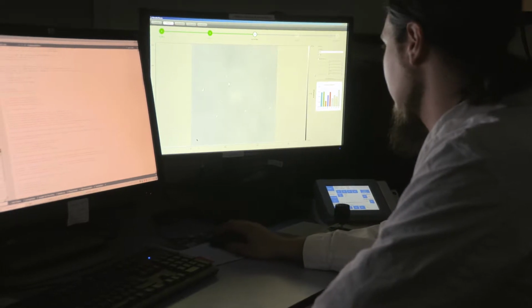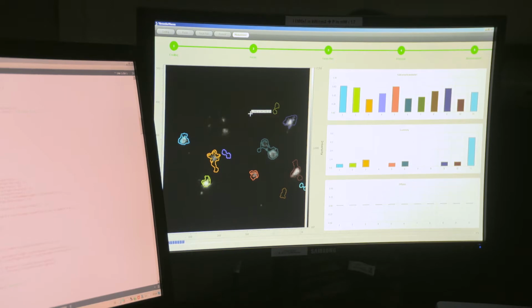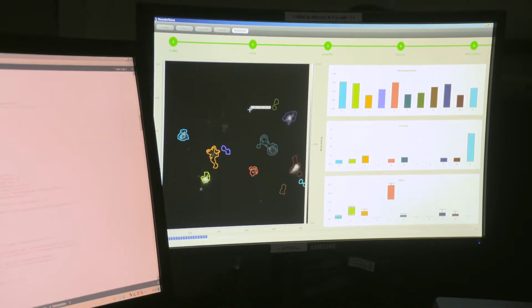living cells or tissues. It allows us, for example, to study dynamic processes like the invasion of a virus into the cell. This enables us to understand better how diseases progress and to develop effective treatment therapies.